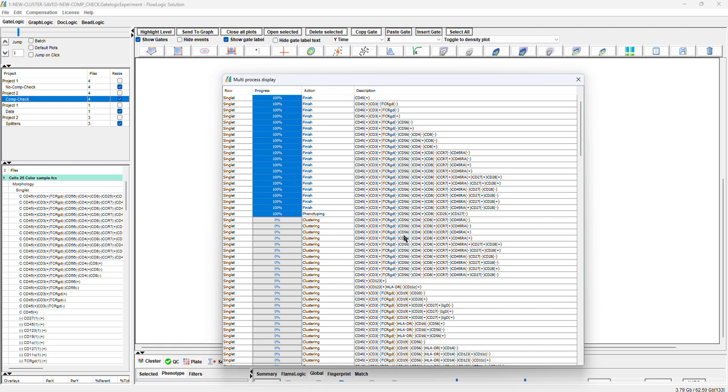of a few seconds. The files we are working with are Aurora files, 25 colors, 750,000 events, so they are not really small files. And practically this is the speed for Flowlogic to do the job.